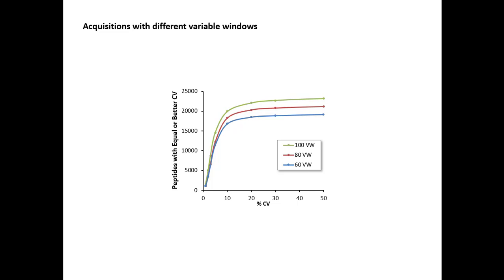Right. But I think in general the field has moved toward somewhat smaller windows. 25 was, I think, a little bit high in some of the busy areas initially. So you really have a lot fewer interferences with smaller windows.